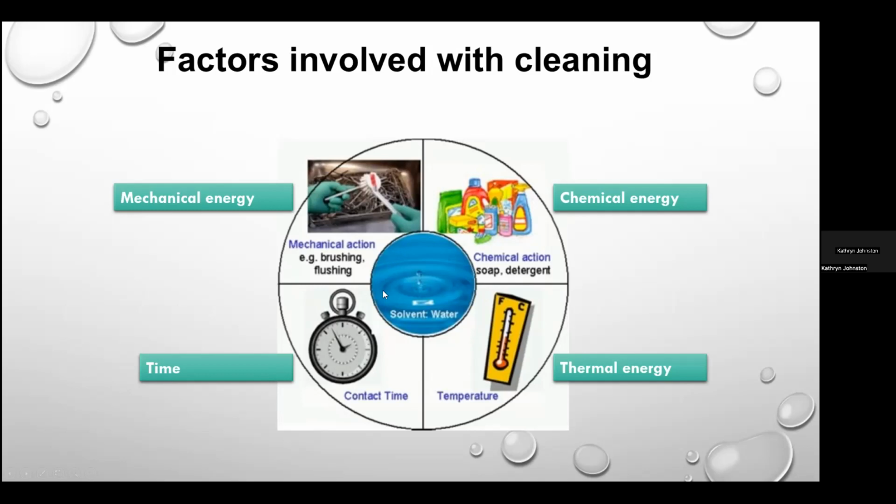And then the key in the middle here with the water is that hard water and soft water have different effects on cleaning. And so it's important to know what kind of water you have and how it impacts the selection of the agents that you're using.